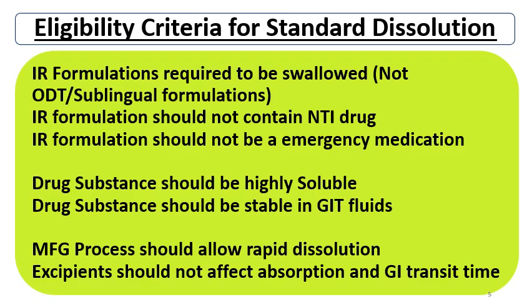IR formulations containing highly soluble drug substances are considered for this type of criteria and dissolution method. But if your formulation is ODT or sublingual, then this criteria cannot be taken into consideration, because for ODTs and sublingual formulations, the site of absorption is the buccal mucosa or oral cavity and not the GI membrane or gastrointestinal tract. That's why ODT and sublingual tablets or buccal formulations are not eligible for this type of standard dissolution conditions and acceptance criteria.